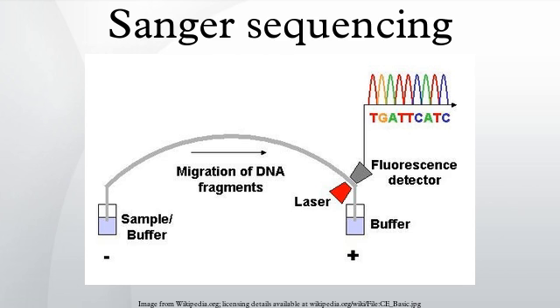a primer labeled at the 5' end with a fluorescent dye. Dye primer sequencing facilitates reading in an optical system for faster and more economical analysis and automation. The later development by Leroy Hood and co-workers of fluorescently labeled ddNTPs and primers set the stage for automated, high-throughput DNA sequencing. Chain termination methods have greatly simplified DNA sequencing. For example, chain termination-based kits are commercially available that contain the reagents needed for sequencing, pre-aliquoted and ready to use.